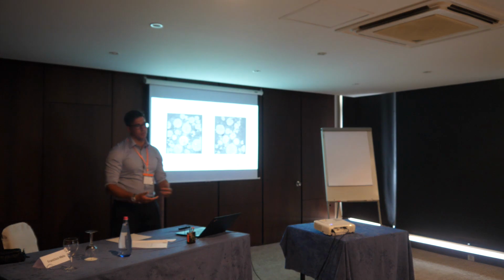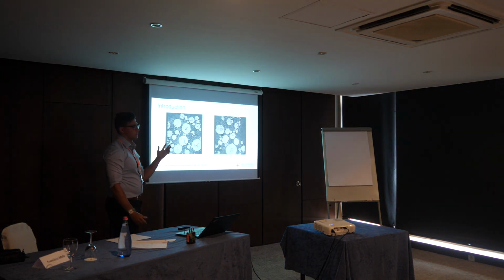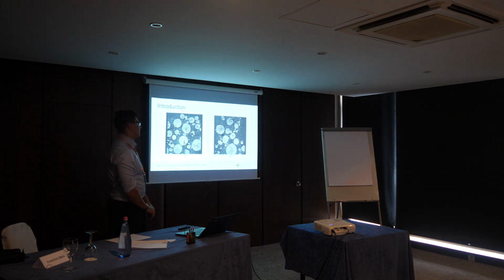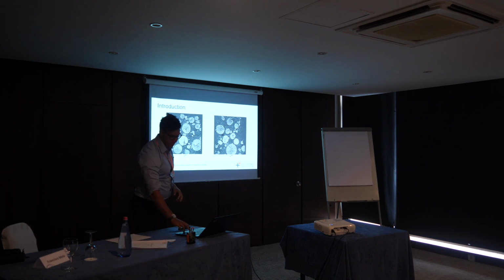So the motivation for this work is that battery materials crack. These images both took 24 hours to acquire, and you can see cracking in both of the samples. So the two issues we wanted to solve: number one, 24 hours to get 50 particles isn't great, and number two, they're both cracked, but how cracked are they? Can we quantify that and reduce the time to scan while doing so?